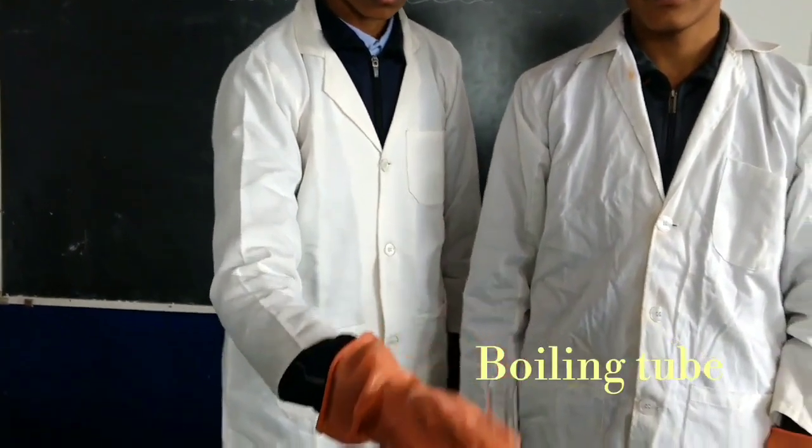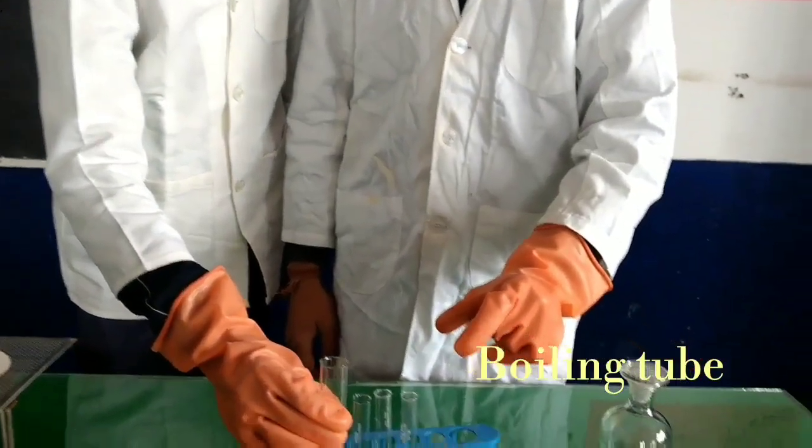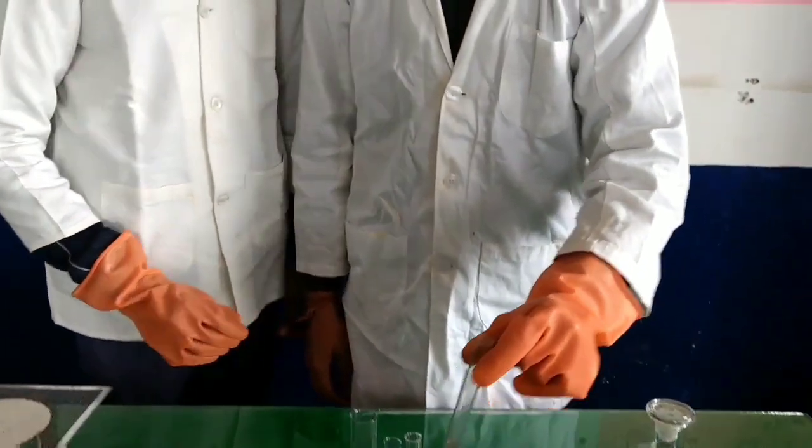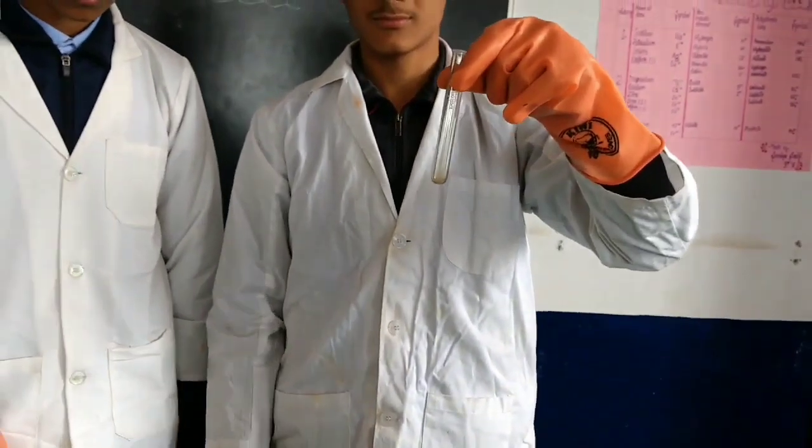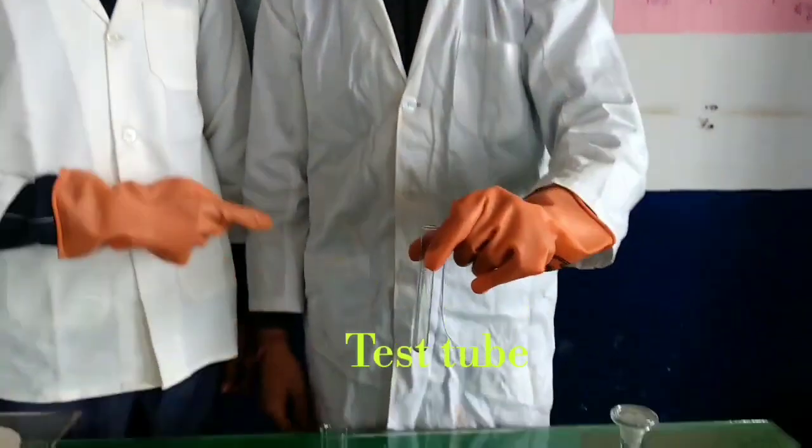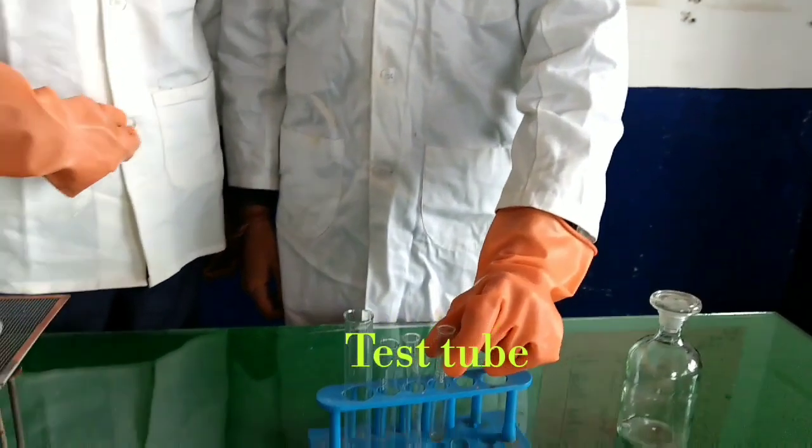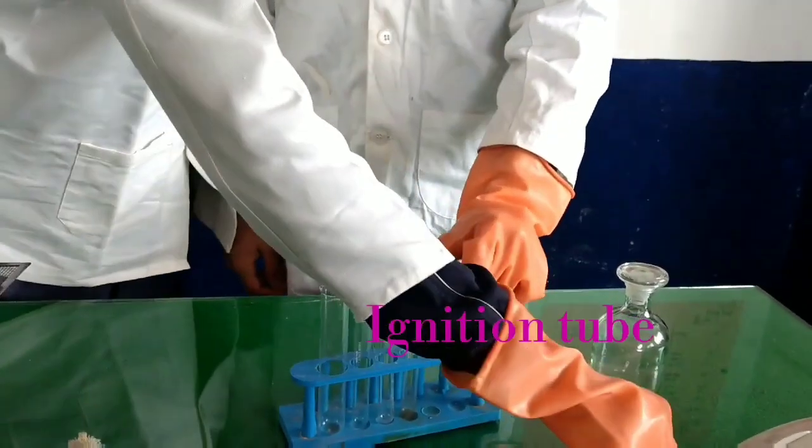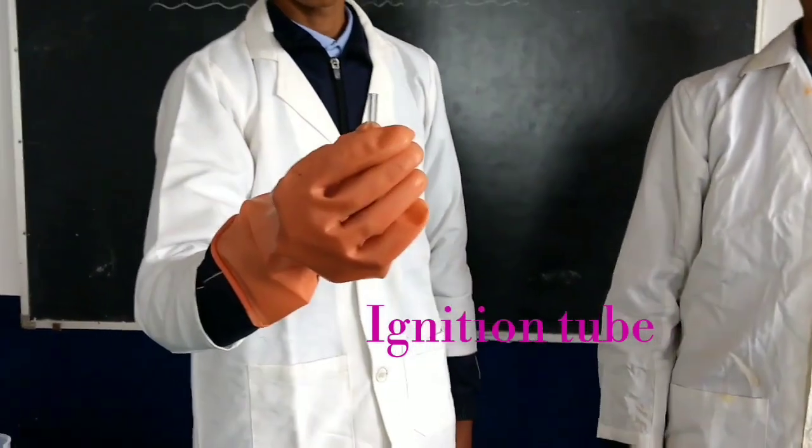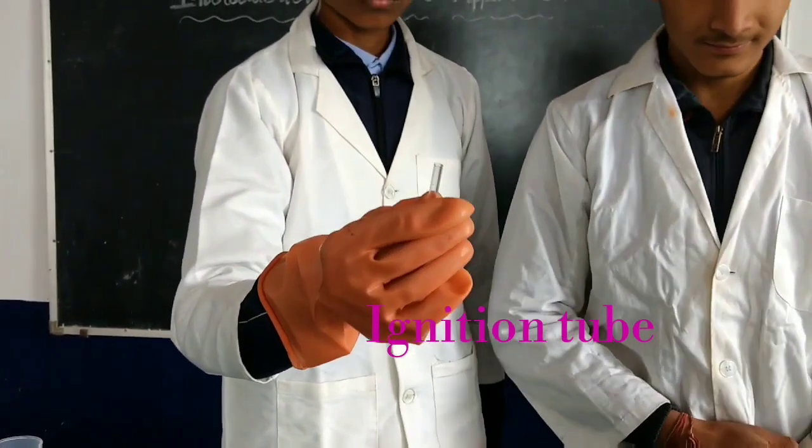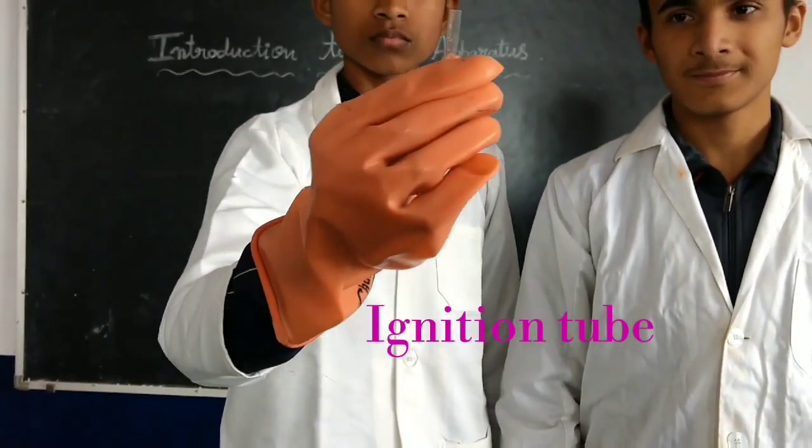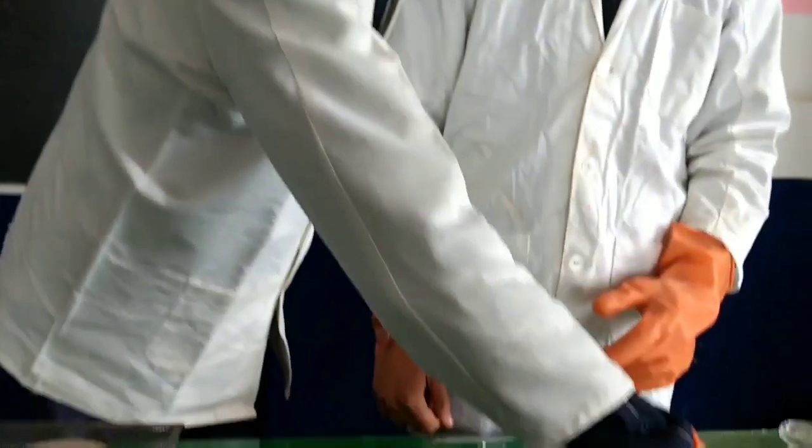First is the boiling tube, which is having 40 ml capacity. And if you want to boil less amount of liquid, then you can take the test tube. For different chemical reactions, we use this test tube. And the small tube with this is the ignition tube, in which we ignite the solid compound.